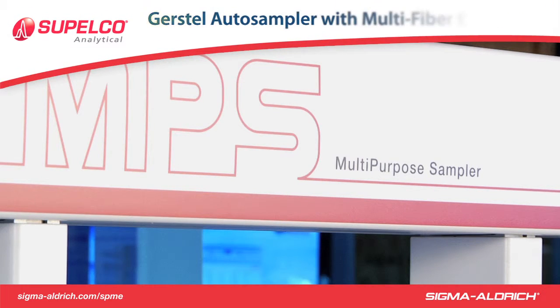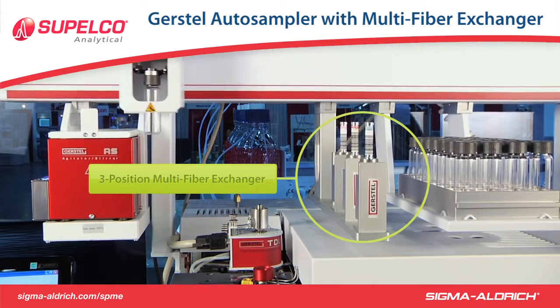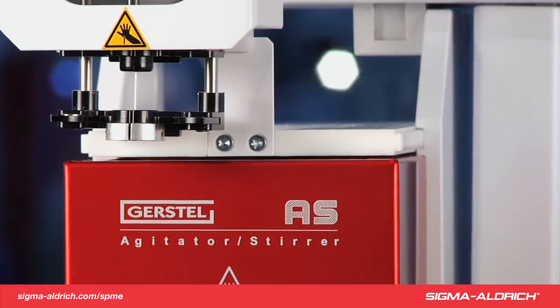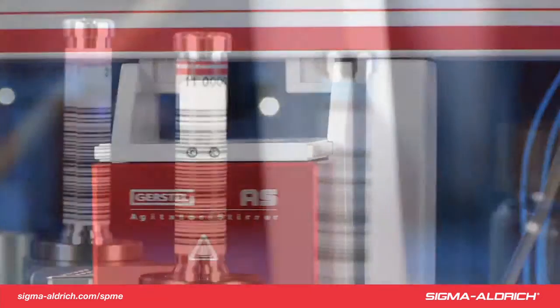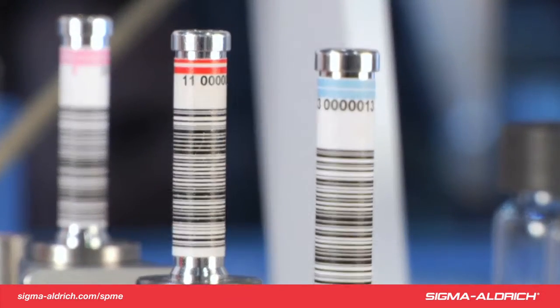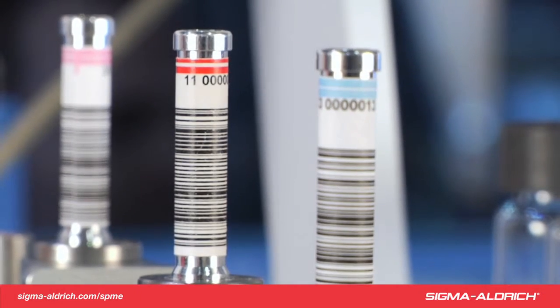The Gerstl MPS Multi-Purpose Sampler uses a three-position multi-fiber exchanger. The Multi-Fiber Exchanger, or MFX, allows automated exchange of SPME fibers on the auto-sampler, for easier and quicker SPME method development and automated desorption.